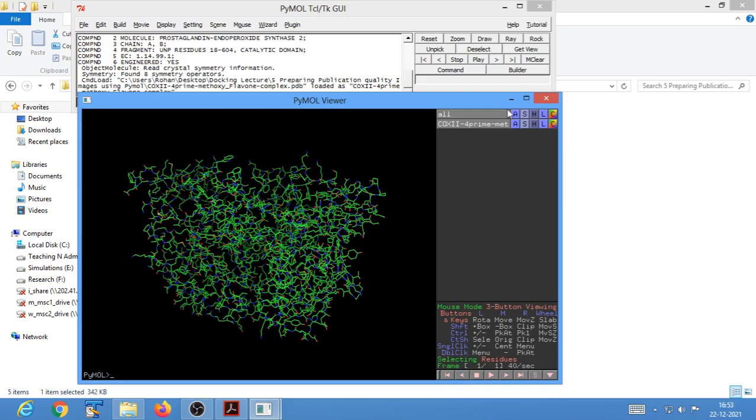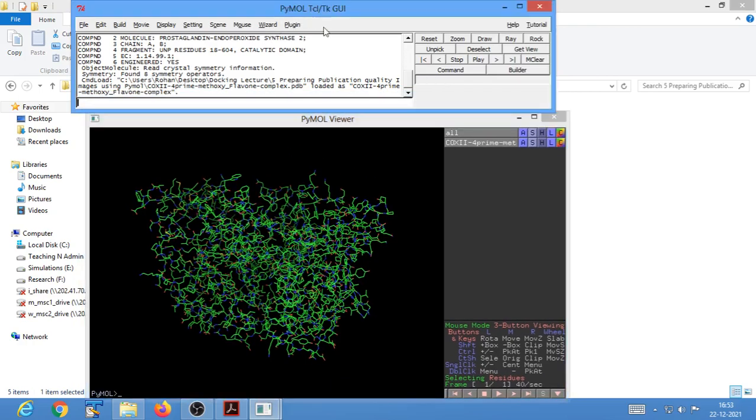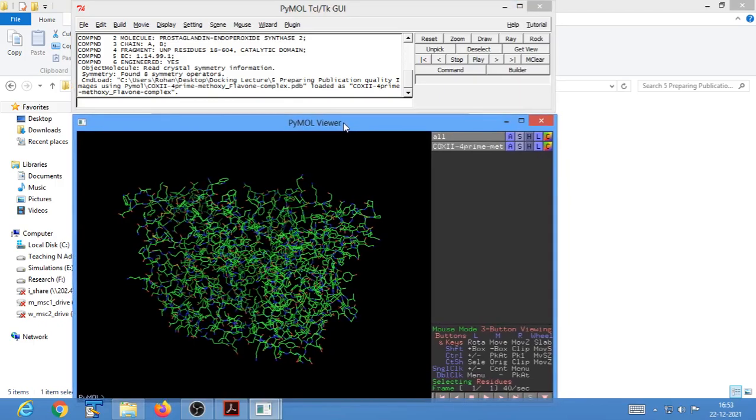Okay, and over here there are some shortcuts that I will demonstrate how to use. These become handy. All these menus are also available in your main toolbar, so it is handy when they are present nearby, right? So these are the two main windows that PyMOL opens with.